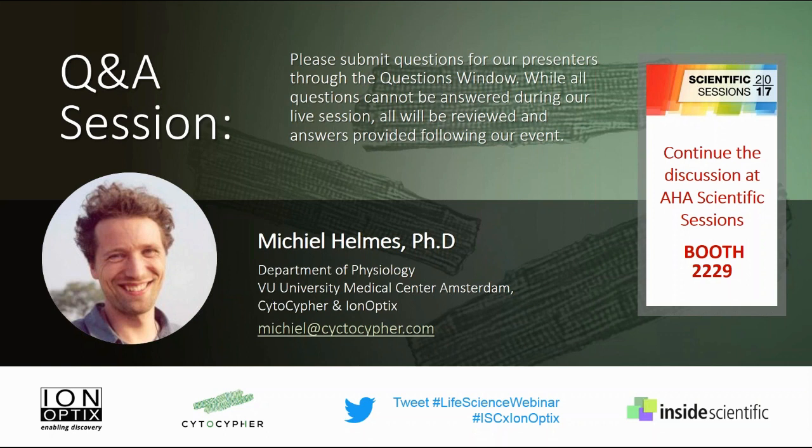Very good. And actually, I'm on this note as well. Is it the case that the pacer is included in the microscope setup, or is that a separate part that needs to be added onto the system? It's a separate part.